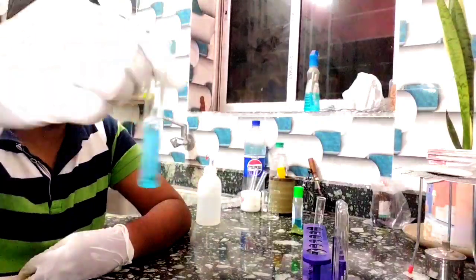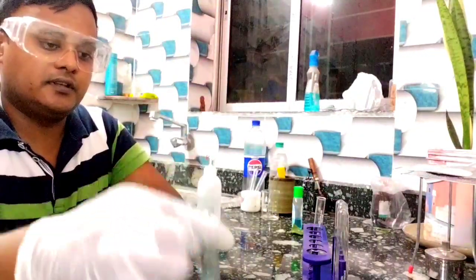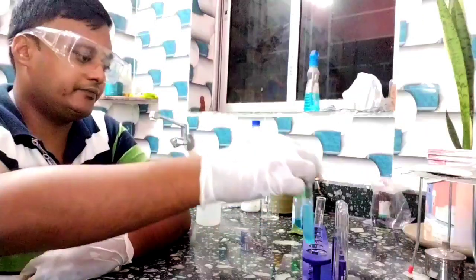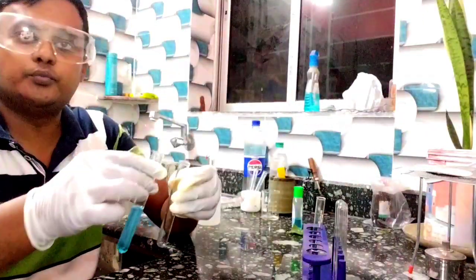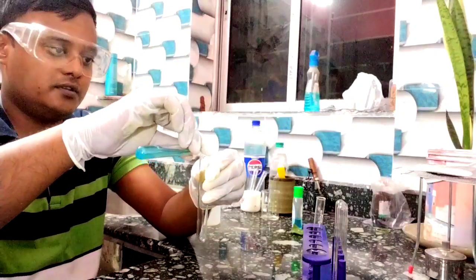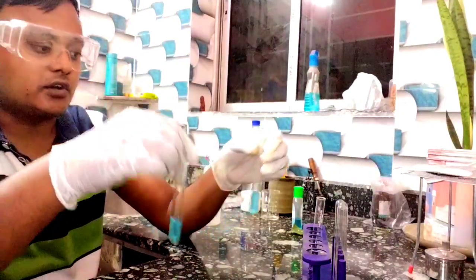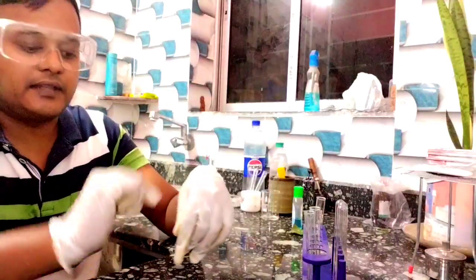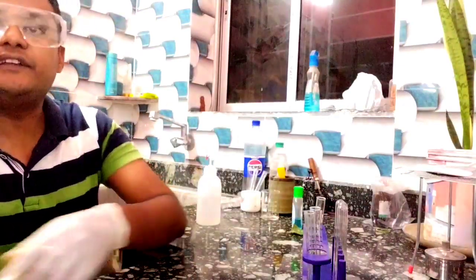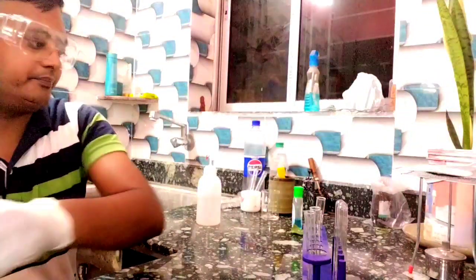See, a clear solution. Let's see, CuSO4, clear solution. Next, I divided it into two parts, because in one part I will add KI solution and in the other part I will directly add solid KI. And we will see what the change is.